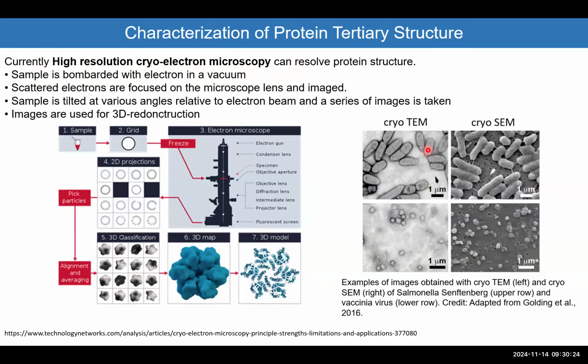And you also could see examples here generating images from bacteria, and there are of course multiple types of the cryo-EM. It's showing you 2 of them. So you can get the details, very, very clean and very detailed details of how the bacteria look like or how a virus looks like.